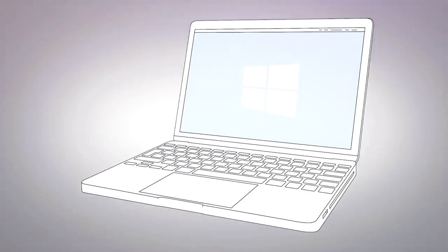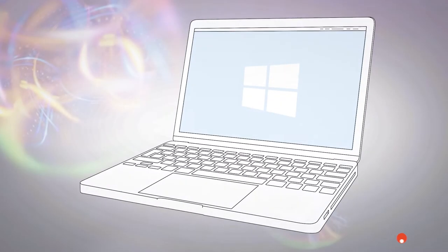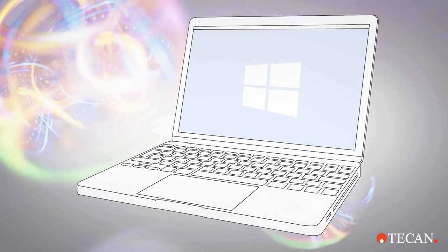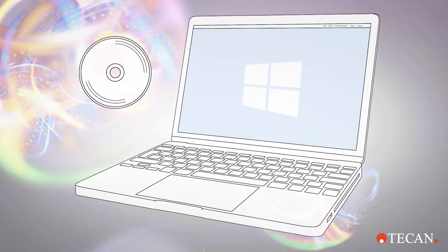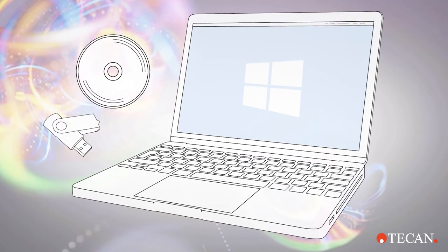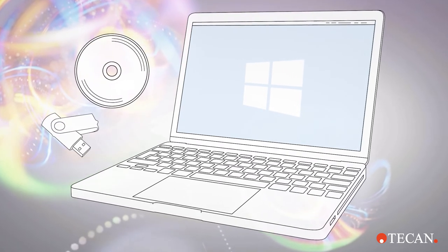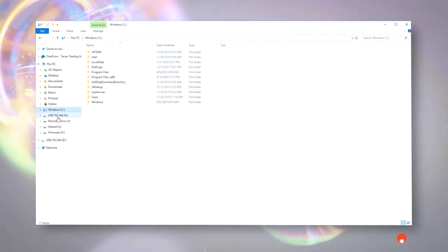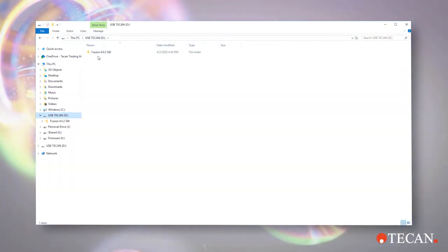Let's install the CAVRO Fusion software and CAVRO Hub communication driver. Install the CD or USB stick into your PC and follow the prompts to install the software. Following the installation steps is easy.